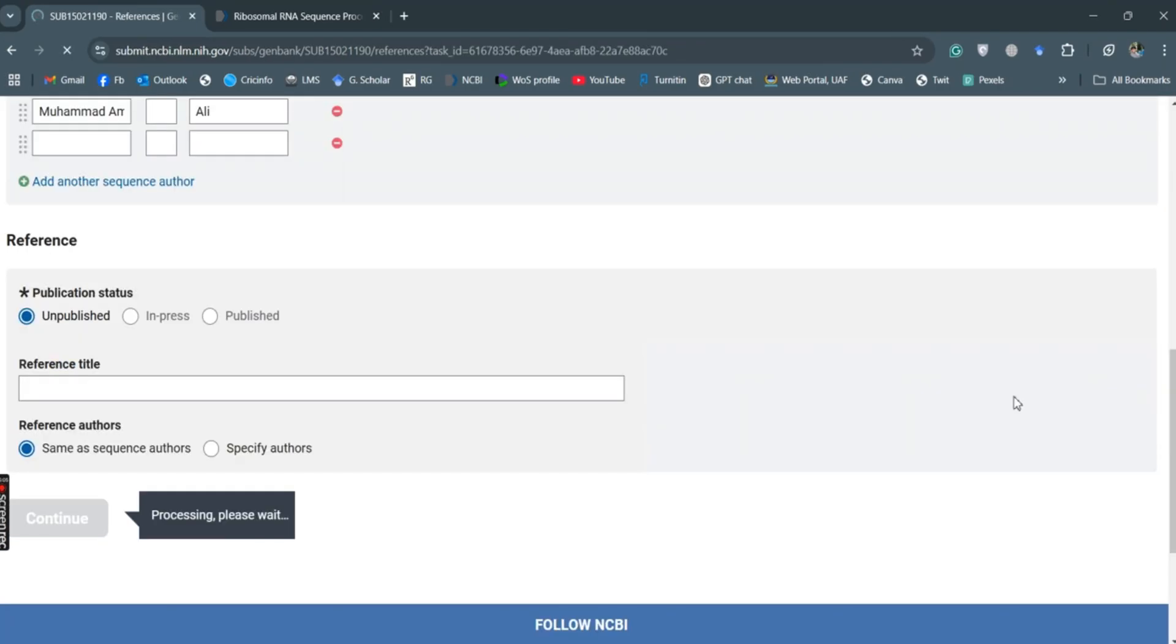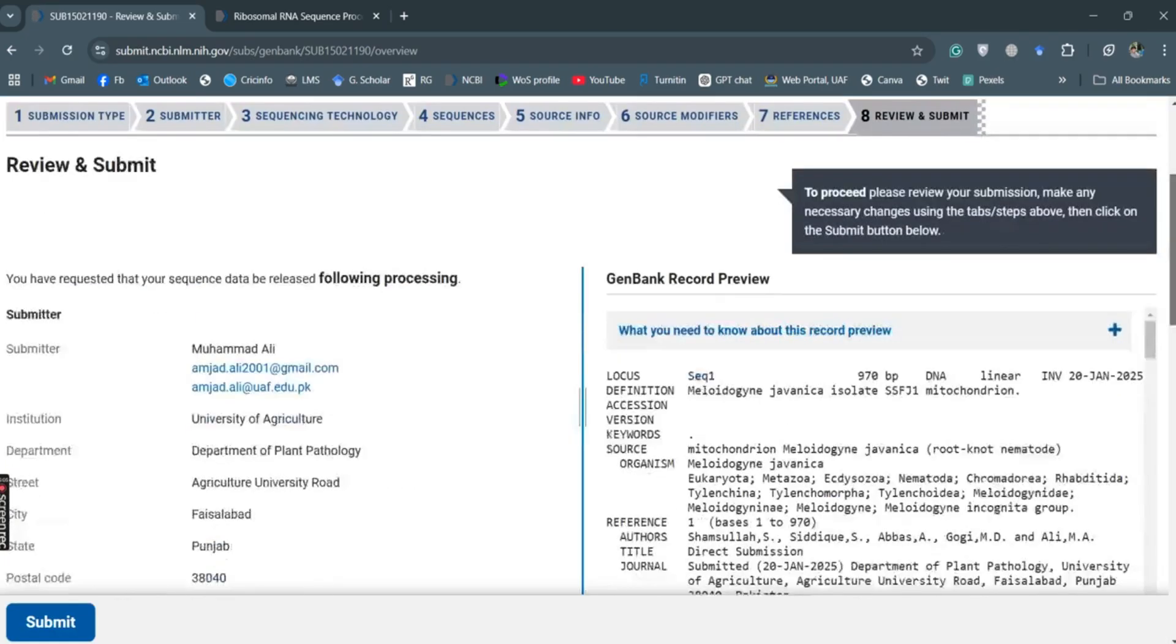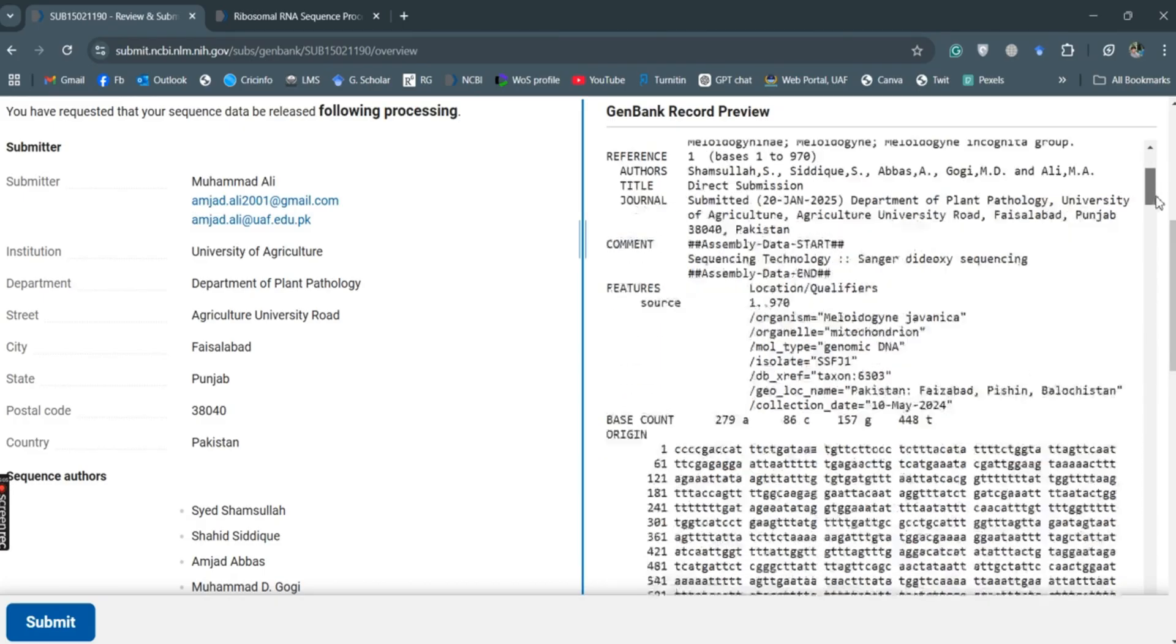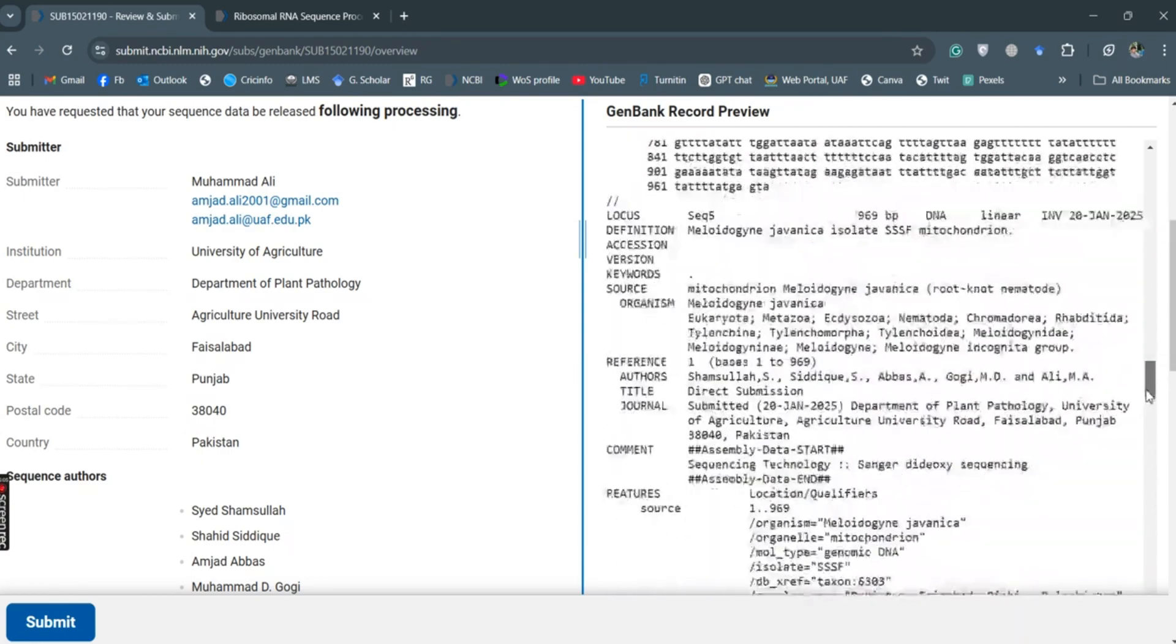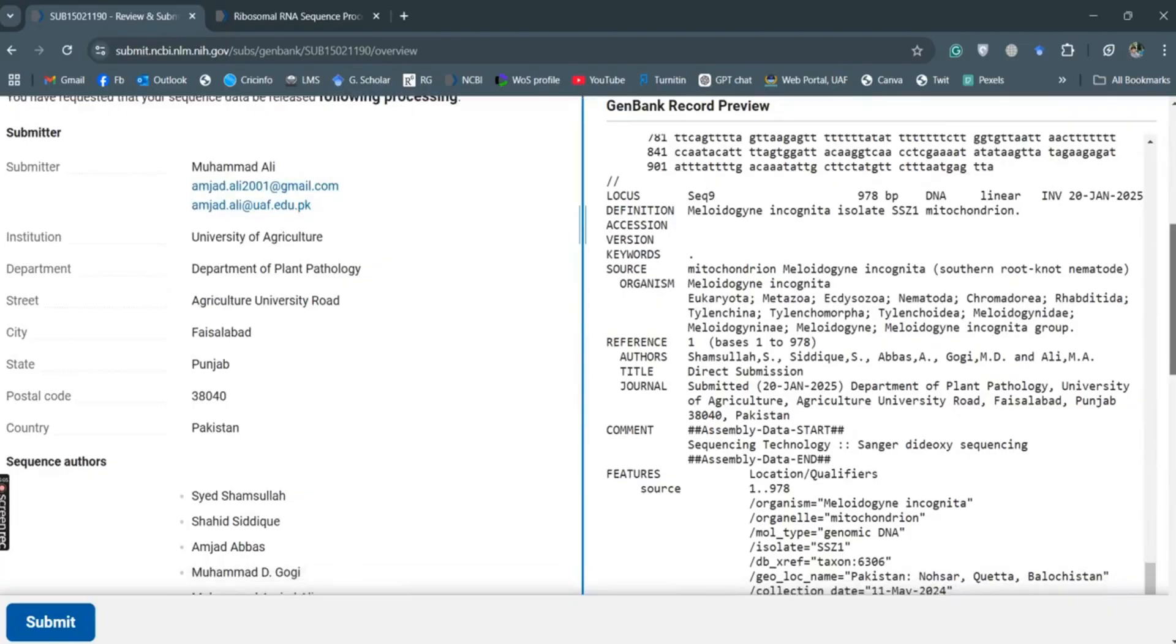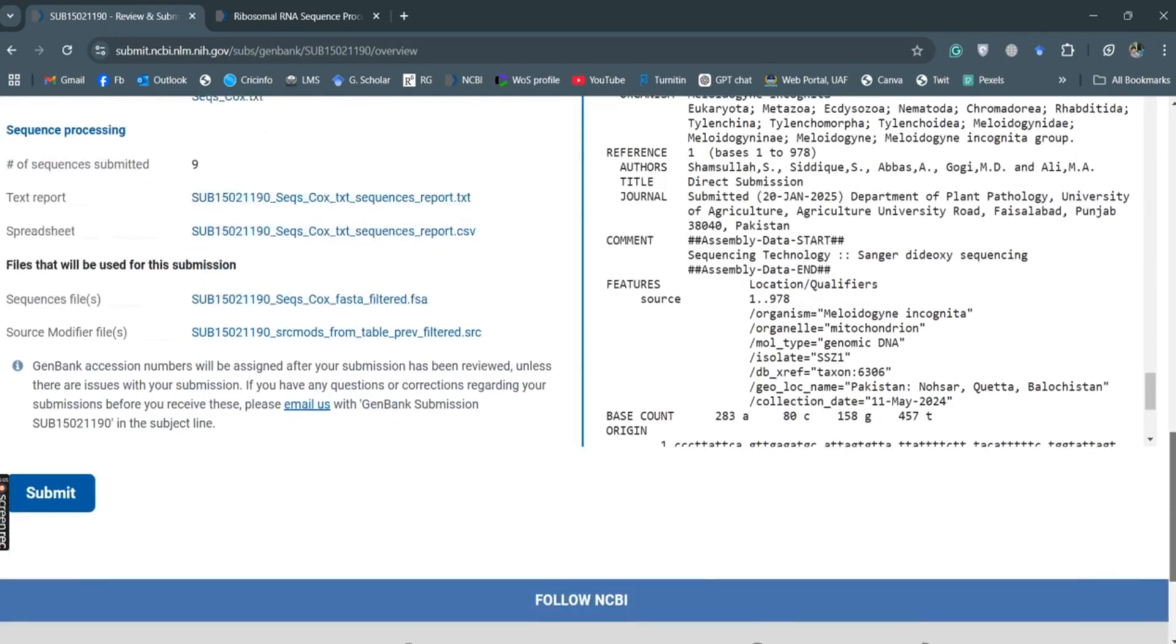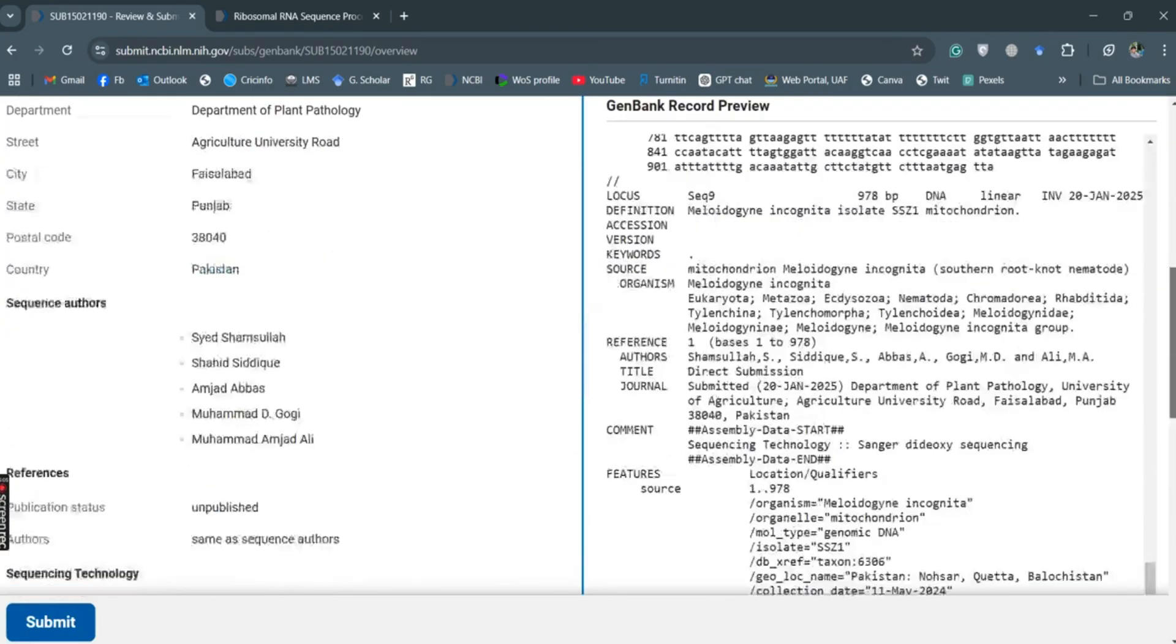So here this is how it will appear on the NCBI database. So everything is in line. Over here, just submit it.